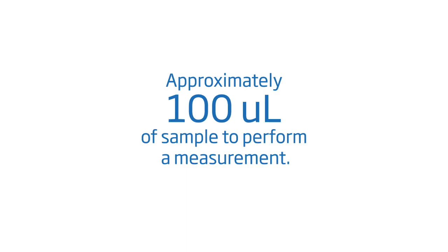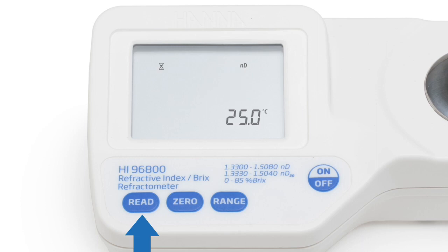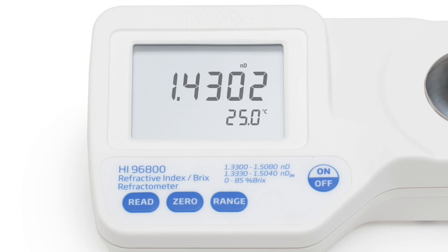The HI-96800 needs only two metric drops, approximately 100 microliters of sample, to perform a measurement. To take a measurement, use the pipette to place the sample on the well and press read. The reading will be displayed on the large, dual-level LCD within a few seconds along with the temperature.